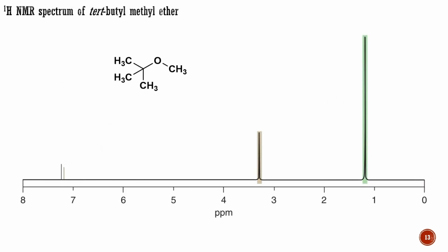Tert-butyl methyl ether is a solvent and fuel additive whose proton NMR spectrum illustrates the effect of a nearby oxygen atom. The large peak at 1.1 ppm comes from the 9 hydrogen atoms making up 3 identical methyl groups of the tert-butyl part of the molecule, while the 3 hydrogen atoms of the methyl part of the ether are at 3.15 ppm. These 3 hydrogen atoms are all bonded directly to a carbon atom, which itself is bonded to oxygen, whose electronegativity attracts their electrons, deshielding the hydrogen nuclei and shifting them to larger chemical shift.